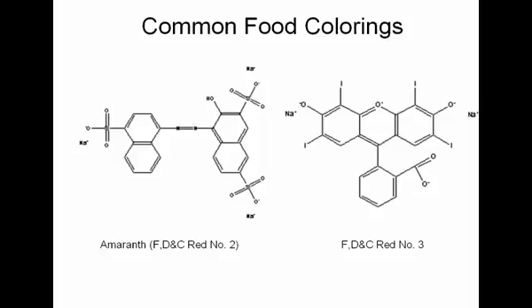I can't remember which one of these was banned by the FDA back in the 70s, I think. There was a red color. They took red M&Ms off the market for a while because the food coloring was a tad bit toxic. And so that red food coloring number, whatever it was, was banned for obvious reasons. But notice what these are.